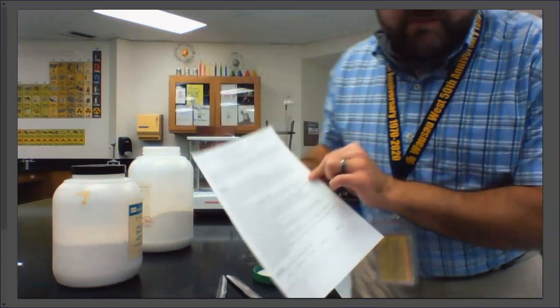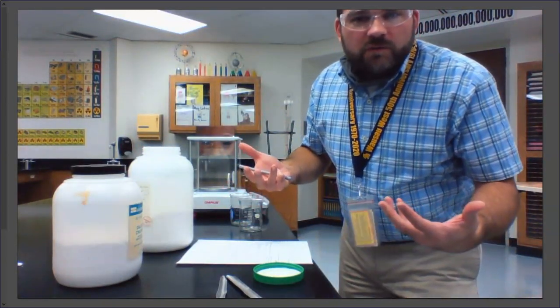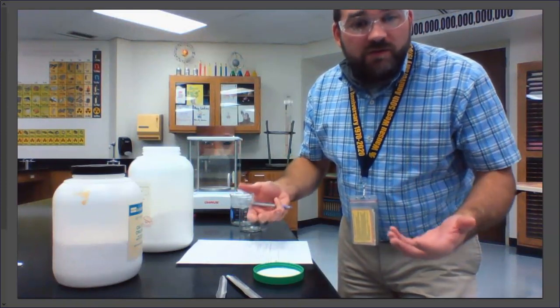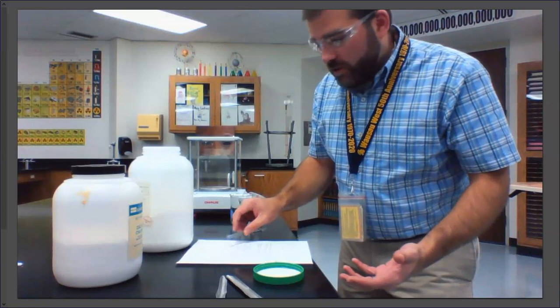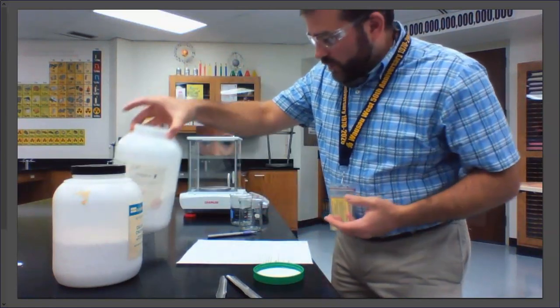You're more than welcome to follow along with me. I'm not going to show everything because it's going to be too long, but I will show you the important stuff and some technique things as we go. So first things first, I'm going to mass out 2 grams of sodium carbonate. This is the sodium carbonate right here. I'm going to do that in a beaker.